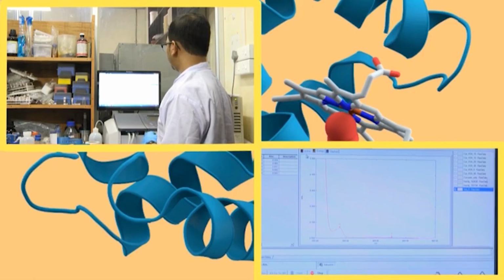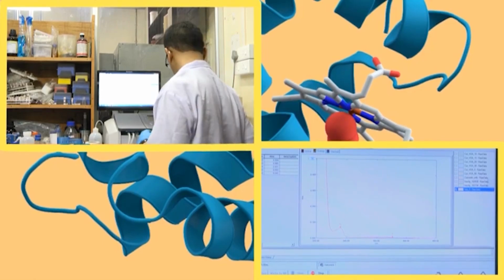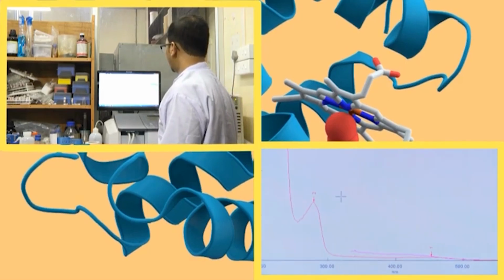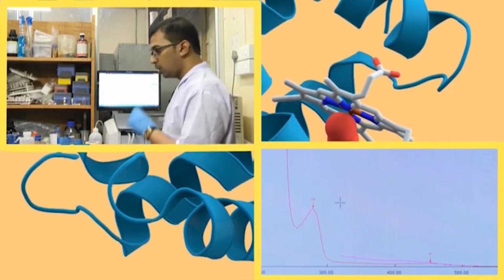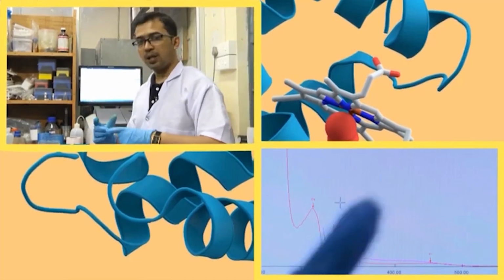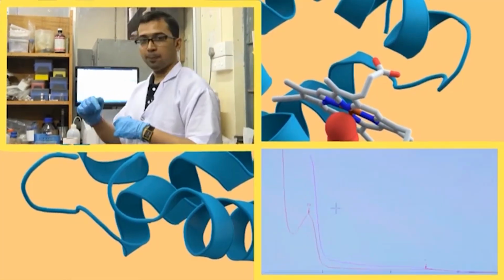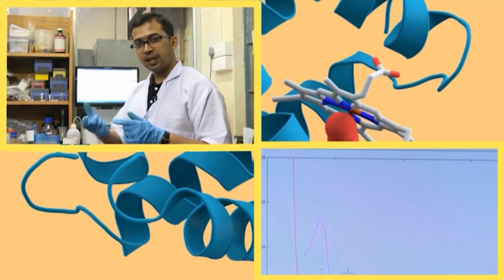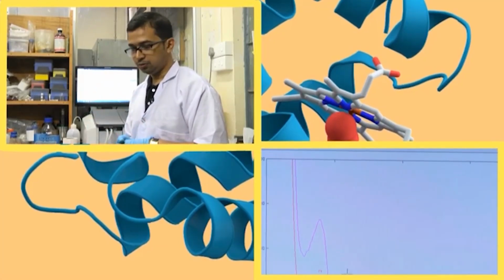However, here we can see the value, if we increase this to 0.2, this value increases. Okay. So, initially what we were doing is taking this curcumin and putting this cuvette cap into it, mixing it and then measuring the absorbance.